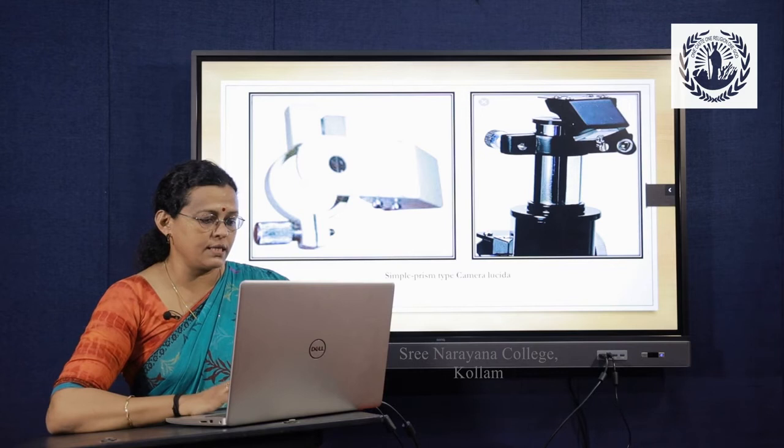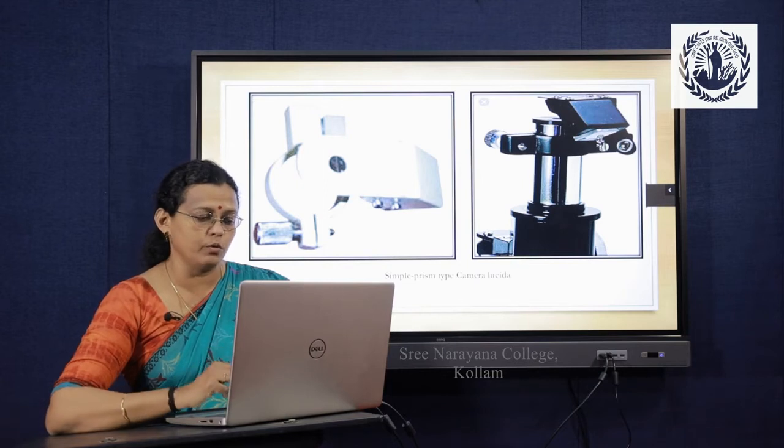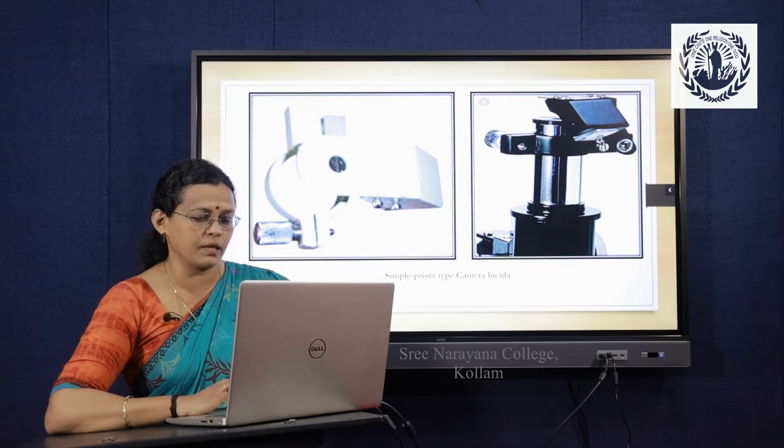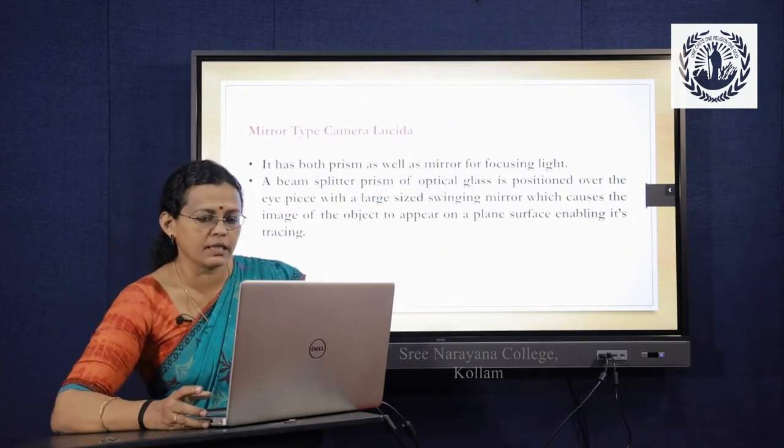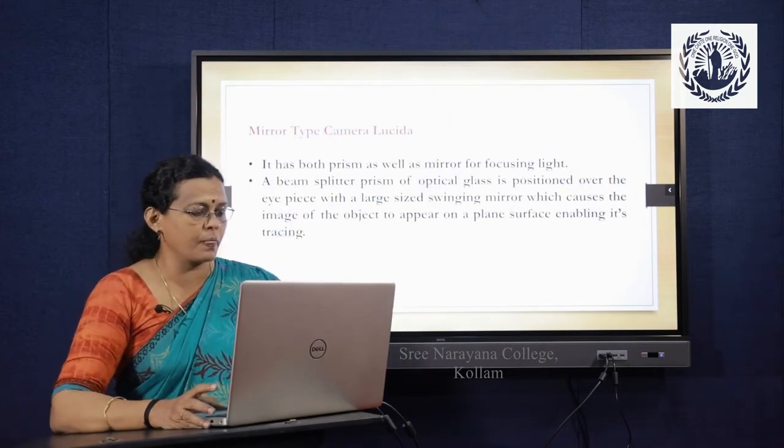So here you can see this is the attachment ring. This is a knob which is used to loosen the loop of this attachment ring, and here you have the prism. See, here it shows the body tube of the microscope onto which this prism type of camera lucida has been attached.